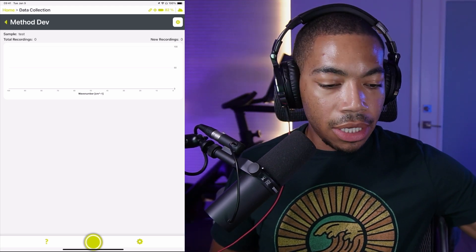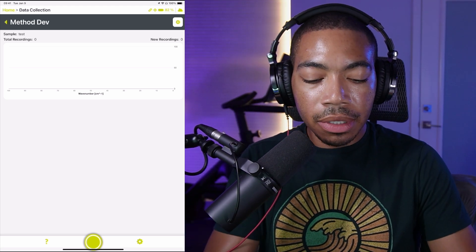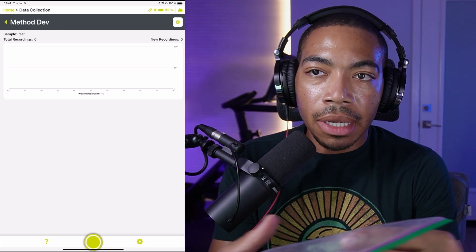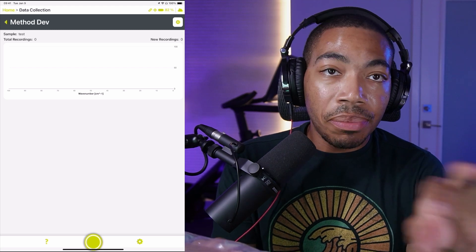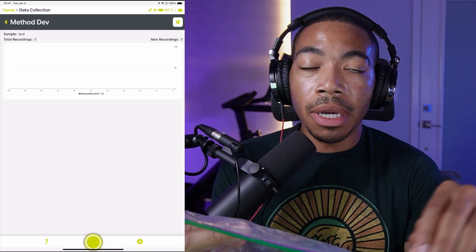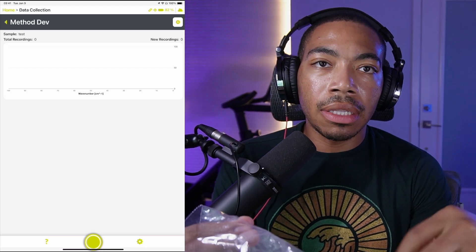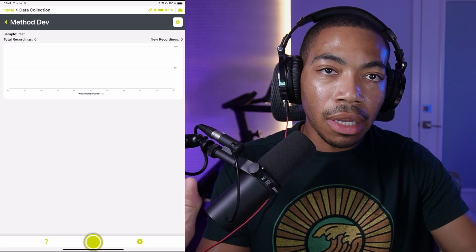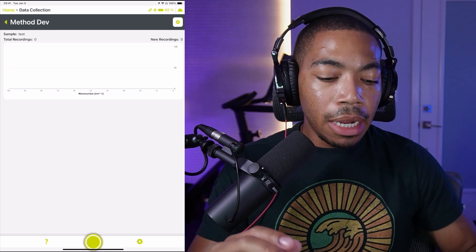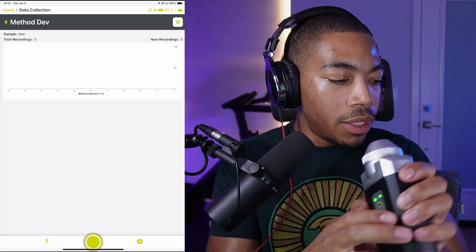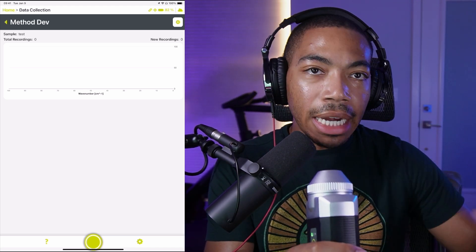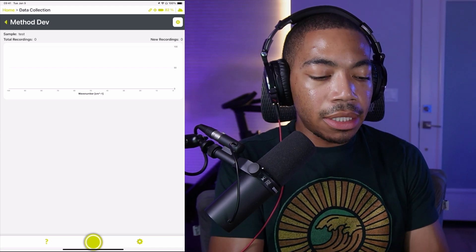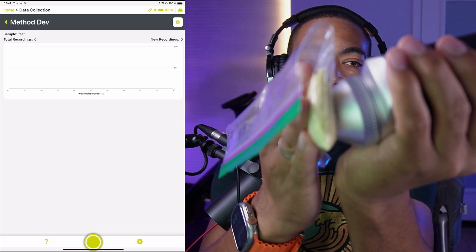What we're going to do now is look at these materials and see what they look like. Instead of doing a lot of sophisticated processing, I'm just going to download this file and throw it quickly into a notebook I've already made that will ingest the data, create a scatterplot of the PCA results, and we're just going to see if we get two clusters. The idea is to determine if we can use this device to separate coffee from anything else — particularly these cereal materials.